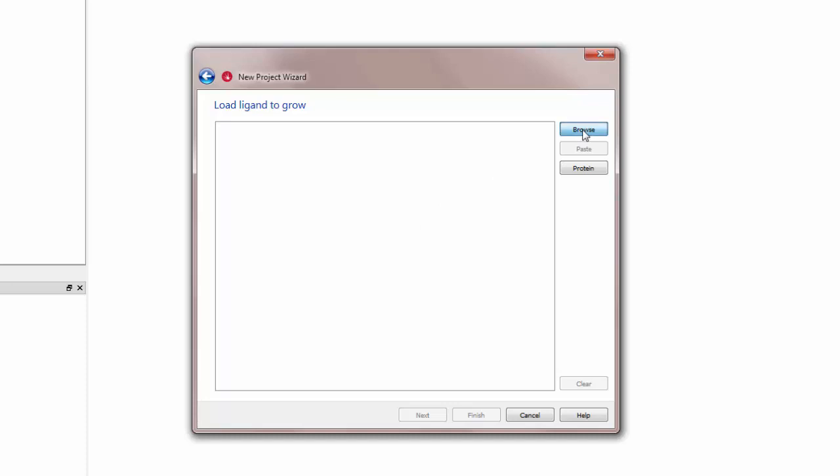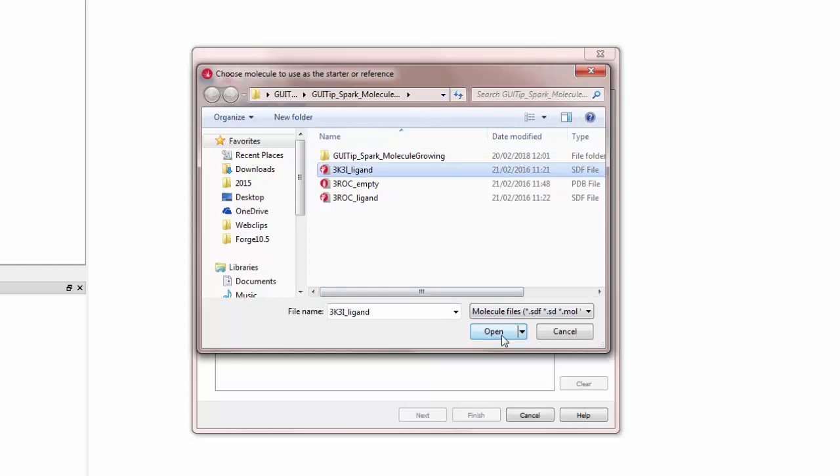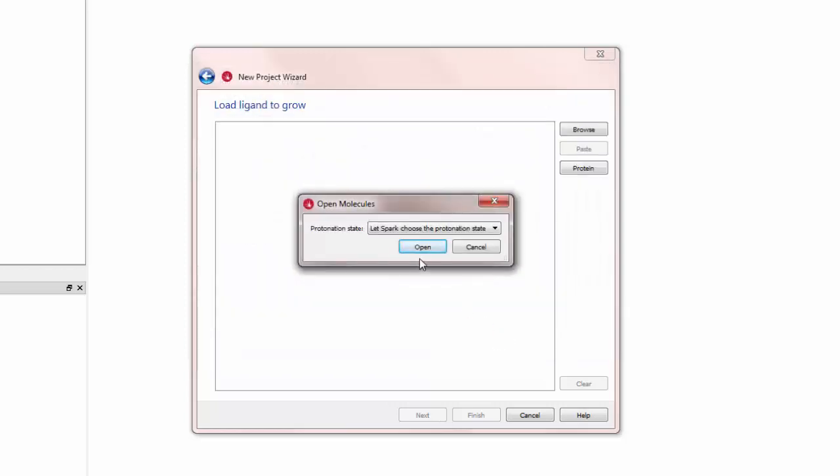The first panel asks me for the ligand that I want to grow. I will open the 3K3I ligand and click Next.